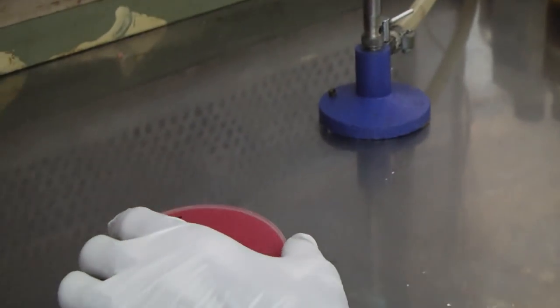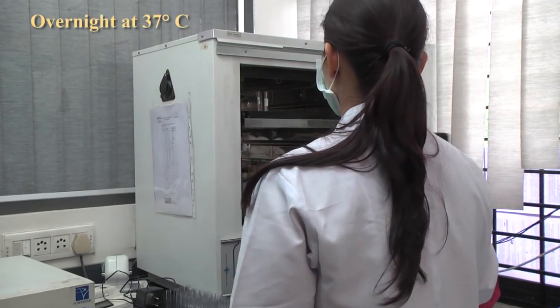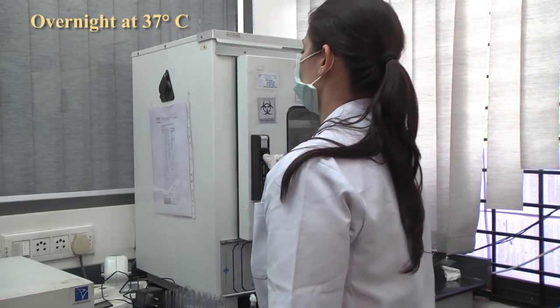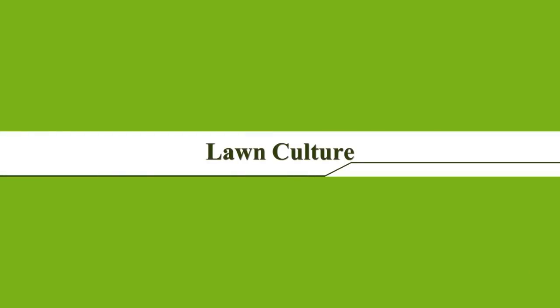Close the lid of the plate and incubate it overnight at 37 degrees centigrade. Isolated colonies of the bacteria can be observed on the surface of the medium the next day.